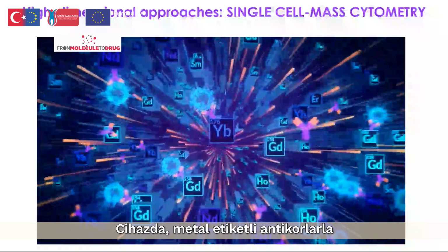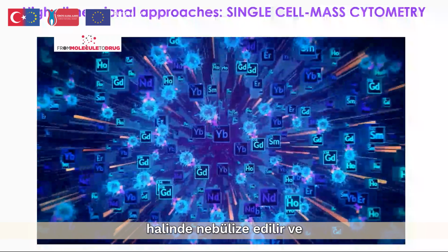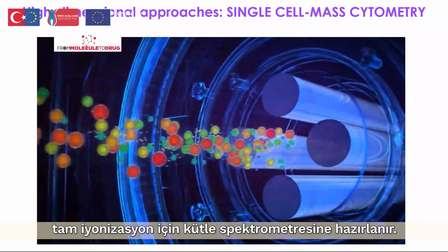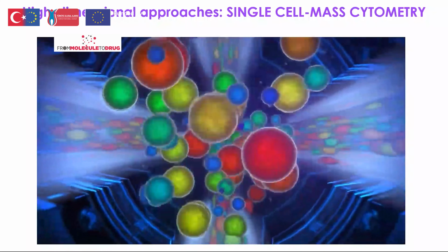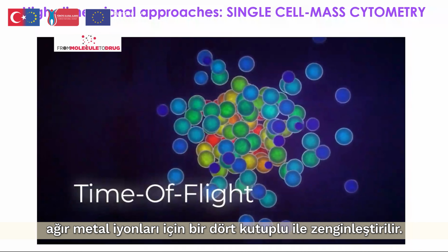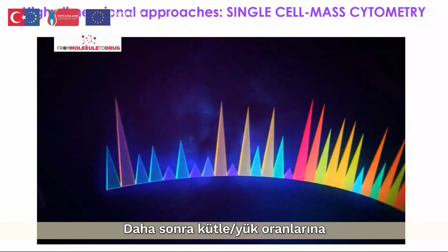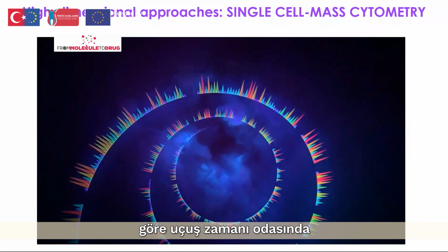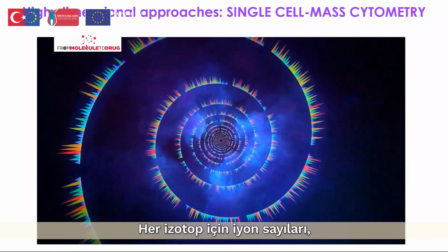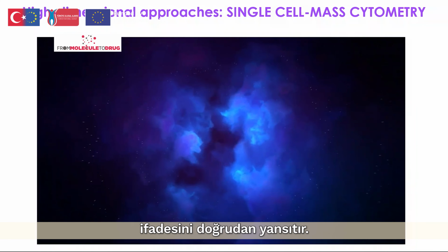In the instrument, cells stained with metal-tagged antibodies are nebulized into single-cell droplets and prepared for complete ionization in the mass spectrometer. The resulting ion cloud is enriched for heavy metal ions using a quadrupole that are then separated in a time-of-flight chamber by their mass-to-charge ratio and detected. Ion counts for each isotope directly mirror the expression of the corresponding targets.